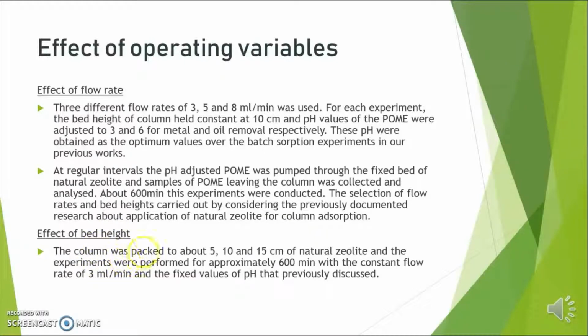We have made 3 different bed heights. The column was packed with 5, 10 and 15 centimeters of natural zeolite, and the experiment was performed for approximately 600 minutes. Same as the effect of flow rate, with a constant flow rate of 3 milliliters per minute and the fixed value of pH that was previously discussed.